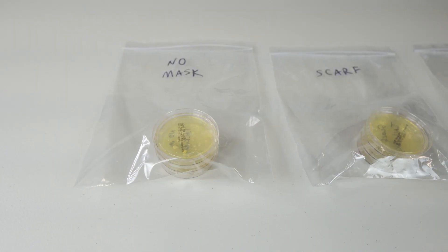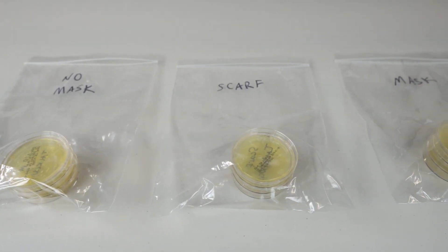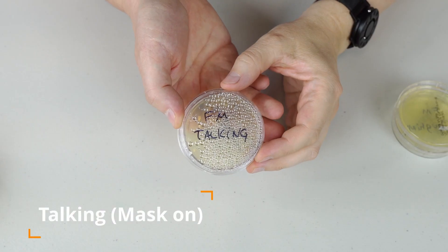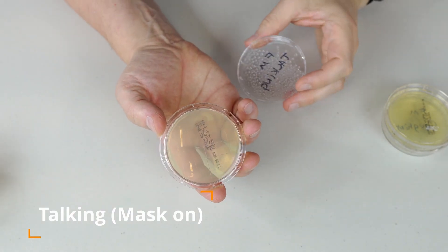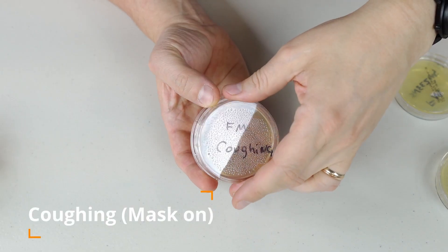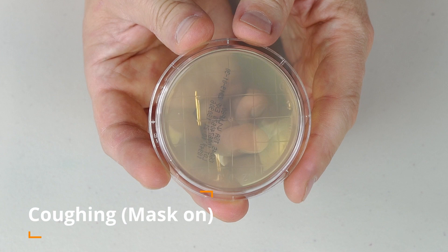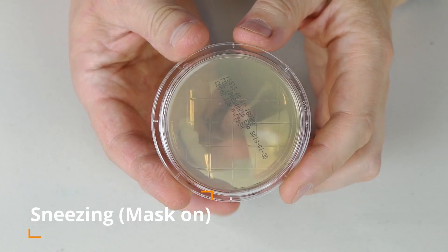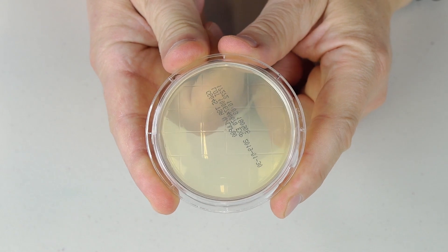Here I have them sorted out — this one is no mask, the one with the scarf on, and the other one is with the mask. Let's check the talking one first. Look at this — I don't see anything growing, not a single colony. What about with coughing? Look at that — again, not a single colony growing. Sneezing with mask on produced no colonies as well. I don't see any colonies growing at all.